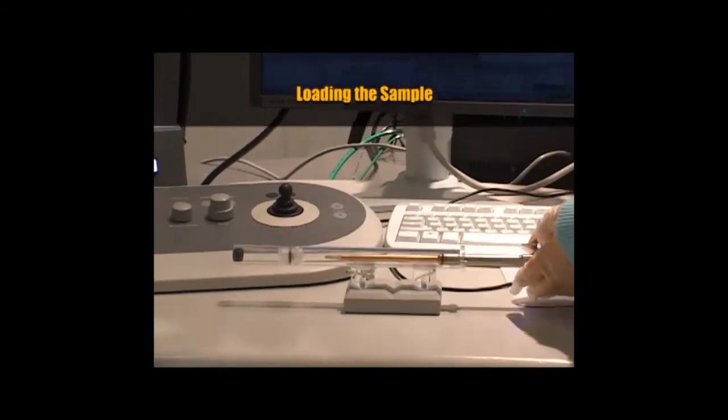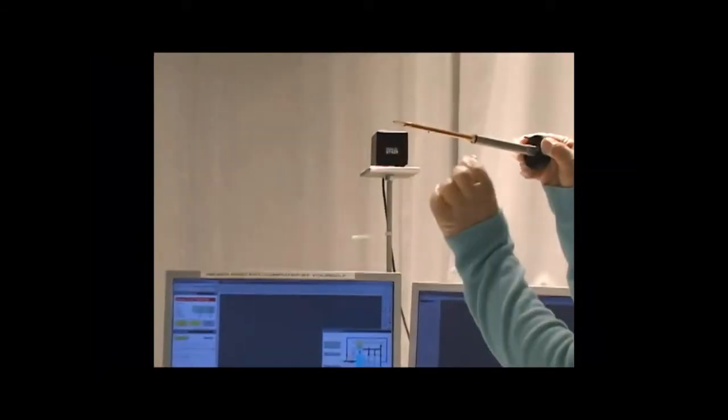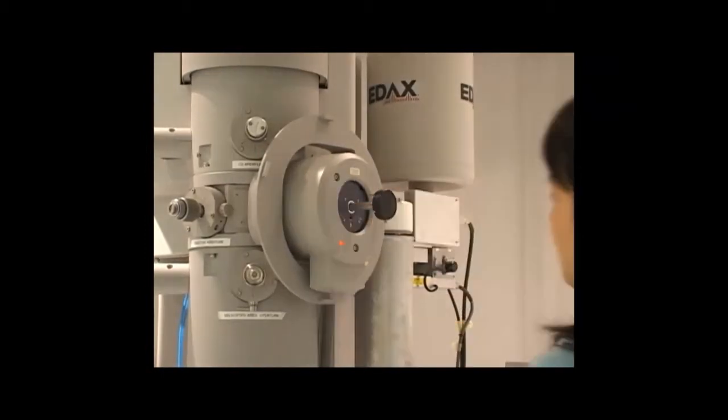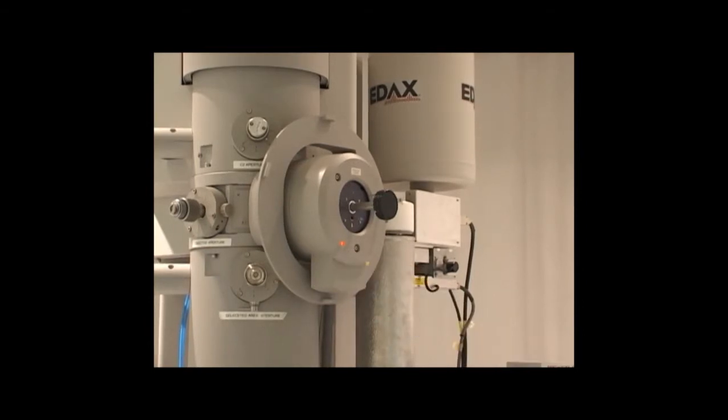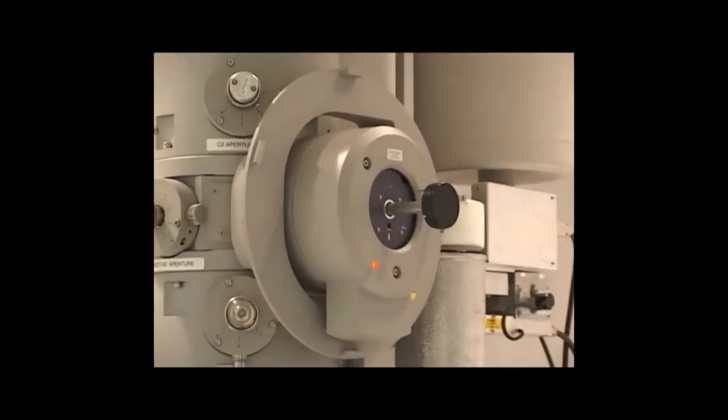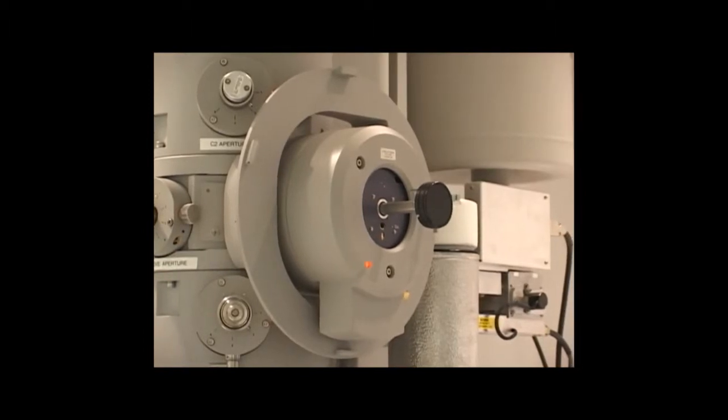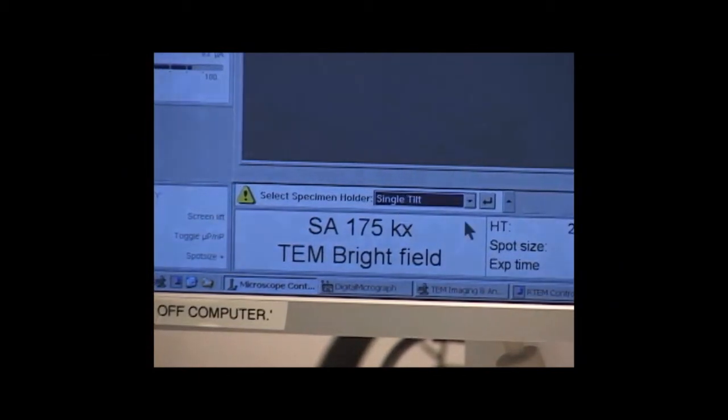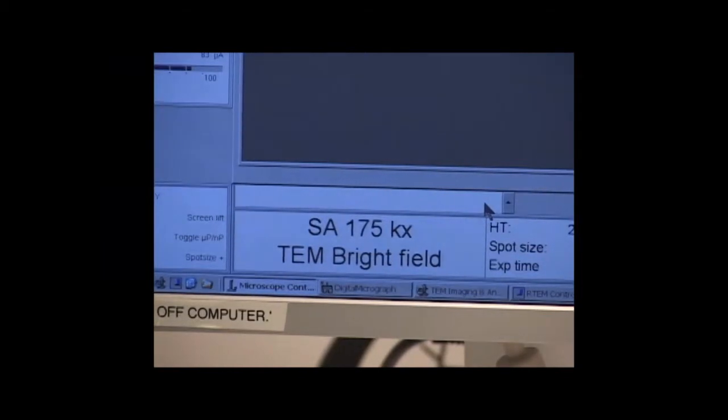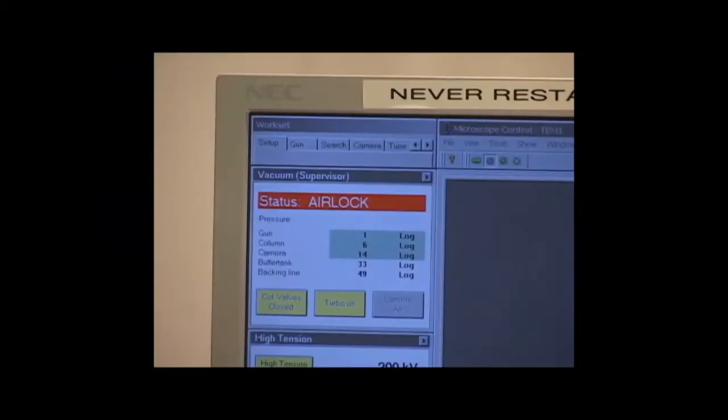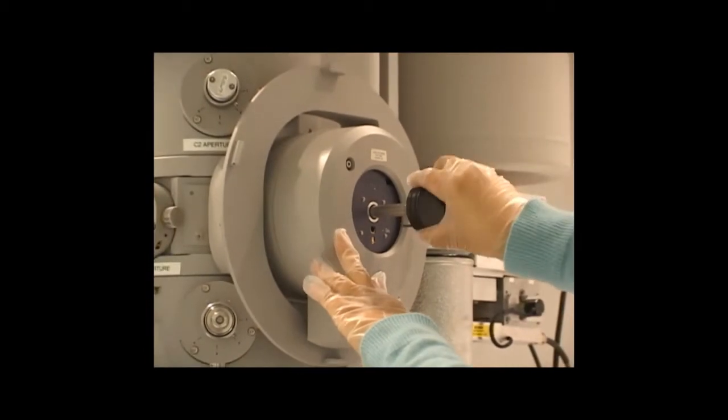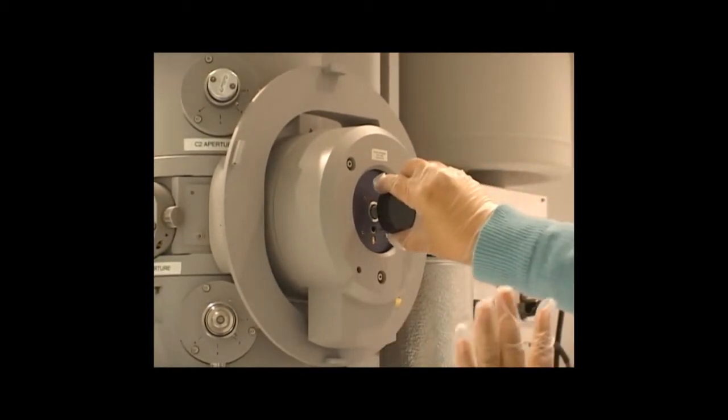Take the holder out of the support. Place the little pin on the holder in the 5 o'clock position with a twist adjustment. The light goes on, the valves are opened, and the pump evacuates the sample chamber. You must wait for several minutes until the light goes off, or you could crash the vacuum. You must also tell the computer that it is a single-tilt holder, so that the holder can be controlled with a joystick.